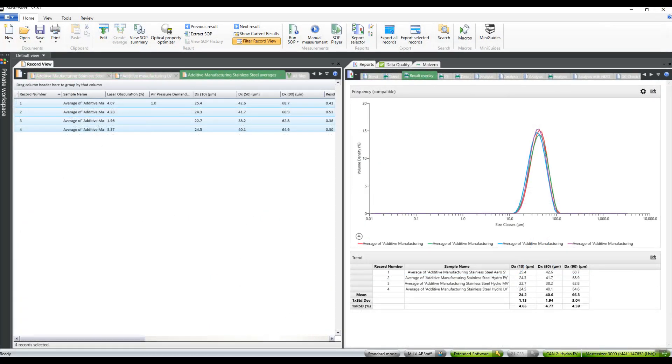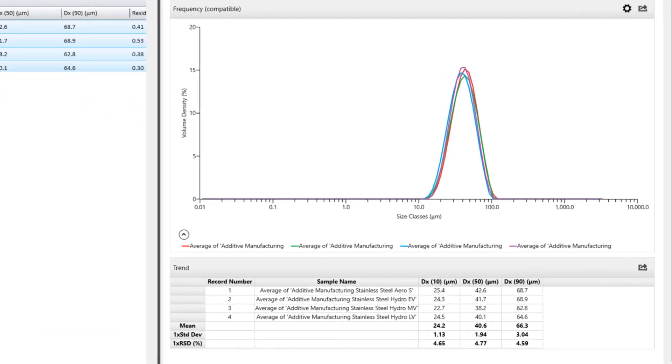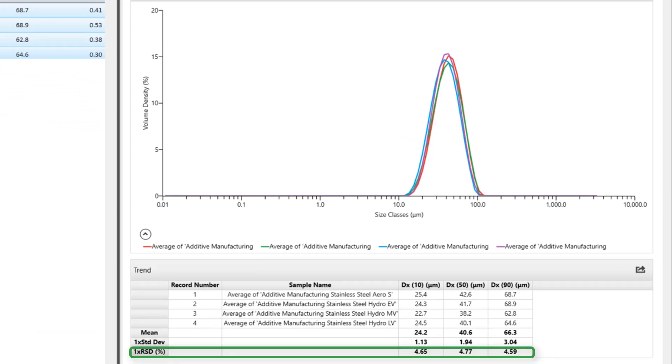Finally, we can take a look at a comparison of the results from the Aero S and Hydro EV, MV and LV. A low variance is observed, as indicated by the relative standard deviations. The same stir speeds were used for the three wet dispersion units, which produces slightly different dispersions of the metal powder due to differences in the tank designs.